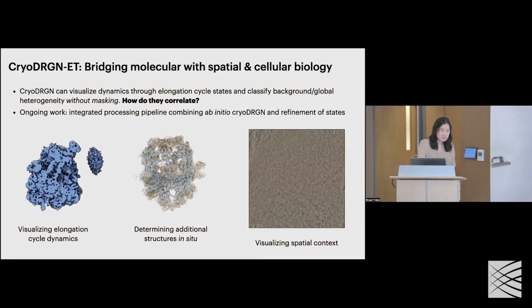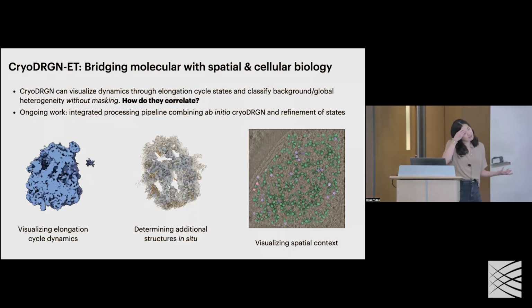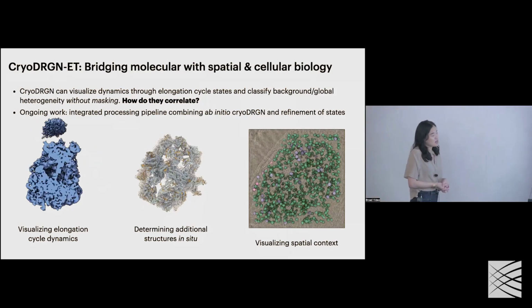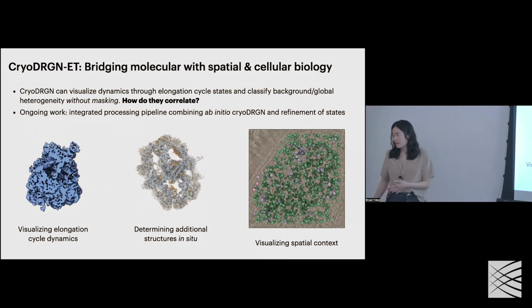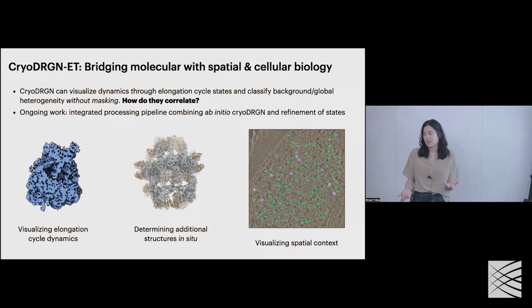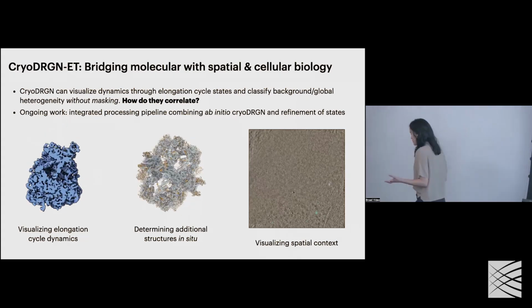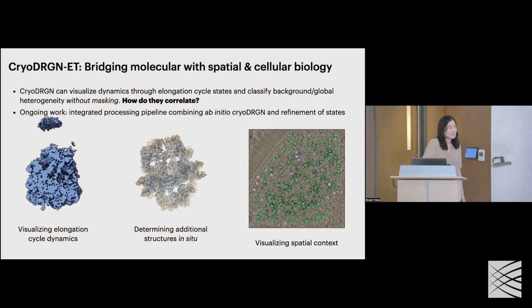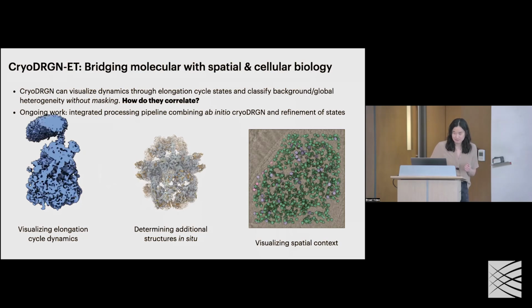Kind of big picture, so we can visualize these interesting intermolecular conformations. One thing that's interesting is integrating this processing pipeline with the traditional processing pipeline. Something that Rish has been working on recently is the ab initio reconstruction in cryo-ET, where we have much more complex samples, since this is the actual collection of protein complexes that you see in vivo, in situ. And so can we actually process this in silico to reconstruct molecular landscapes?